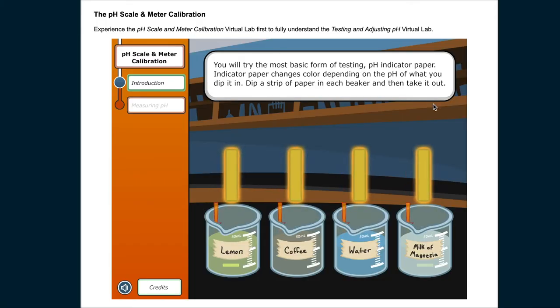You will try the most basic form of testing, pH indicator paper. Indicator paper changes color depending on the pH of what you dip it in. Dip a strip of paper in each beaker and then take it out.